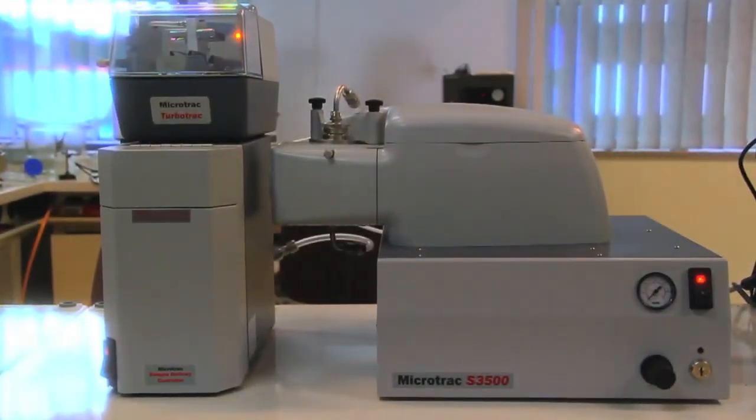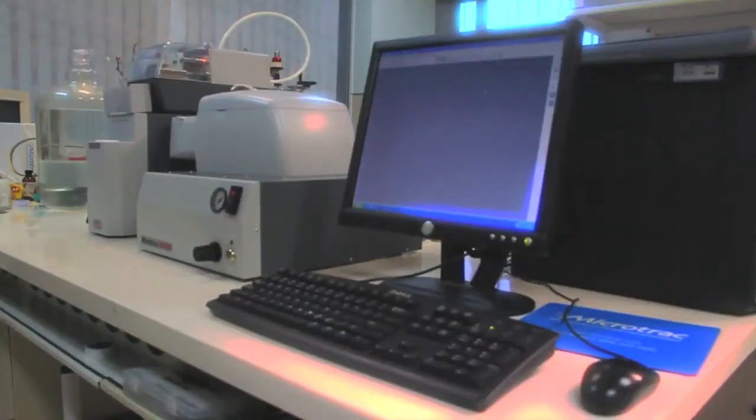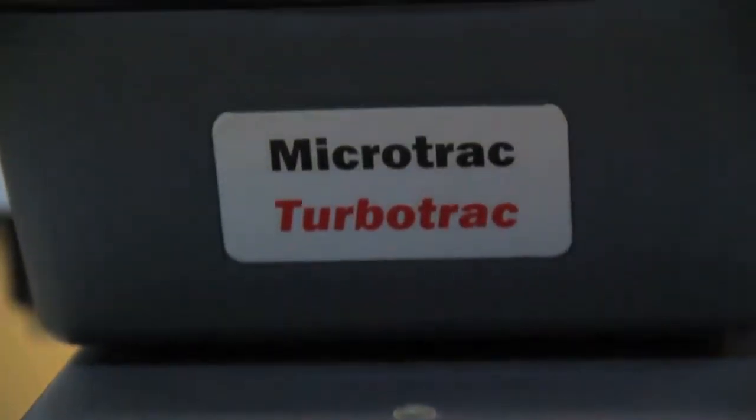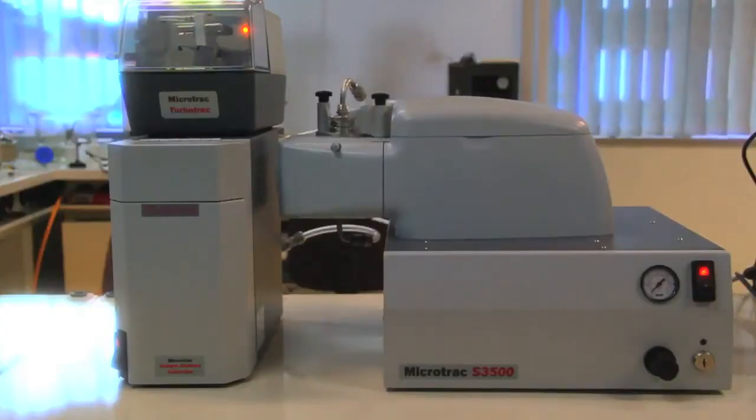I would like to introduce the Microtrack S3500, which is a particle size analyzer based on laser diffraction. It allows the user to determine the particle size distribution of liquid suspensions as well as dry powder particles.